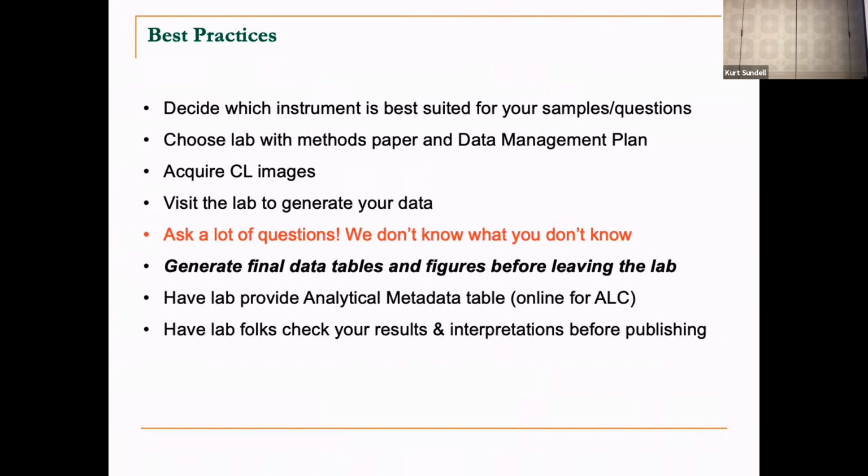And so we will talk about that a little bit in the petrochronology area. So most of the standards that we use for geochronology, we want them to be what we call matrix matched. That means that they are made out of the same mineral or material as what we want to measure. So I'm not going to use a zircon standard to measure Kurt's rutile. That's why he's carrying around rutile standards with him. Okay.